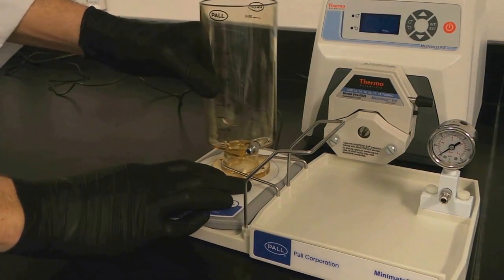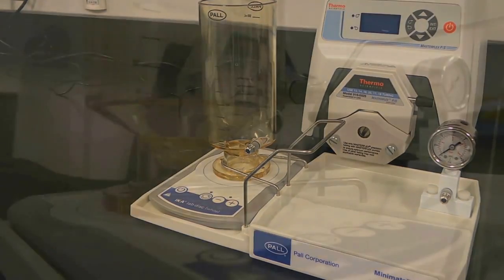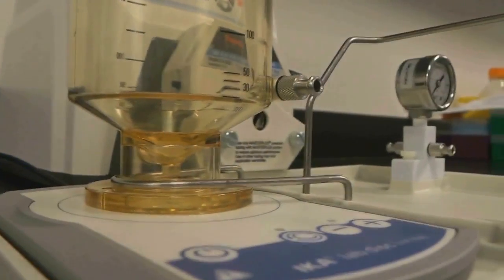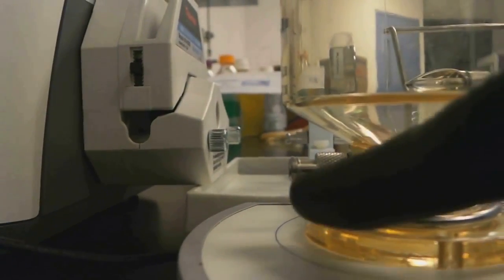Slide the reservoir underneath the metal holder and make sure the higher reservoir port is facing forward. For the lower reservoir port, verify the fitting is above the support bar.